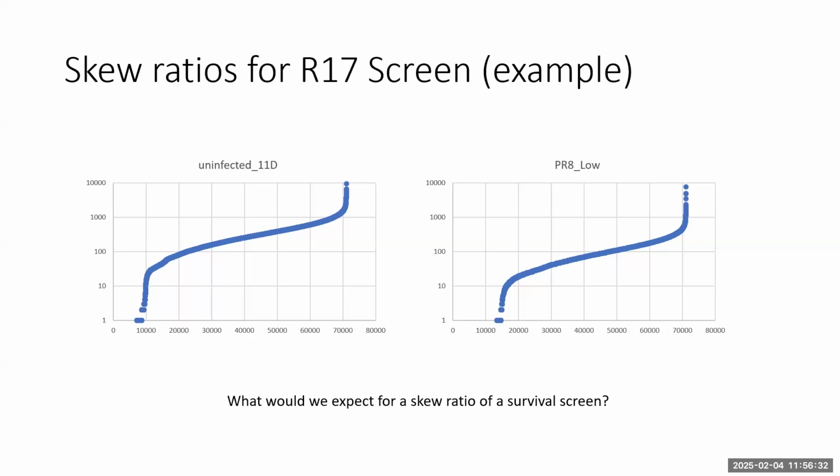We have had results where, for example, we tried transducing our cells, selecting them, growing them up, and then freezing them down. We thought, well, we can do that once. We can freeze these all down, keep them in liquid nitrogen, and whenever we want to do a screen, just resuscitate them and do our screen.